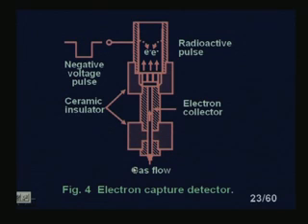Now, the electron capture detector has two electrodes within, with the column effluent passing between. One of the electrodes is treated with radioisotopes that emit high energy electrons as it decays, and these emitted electrons produce a large amount of low energy thermal secondary electrons in the gas chromatography carrier gas, all of which are collected by the other positively polarized electrode.